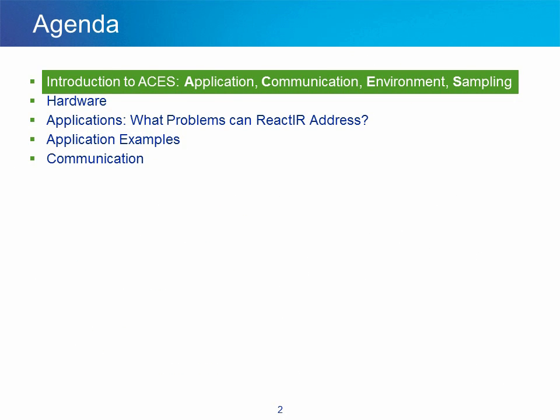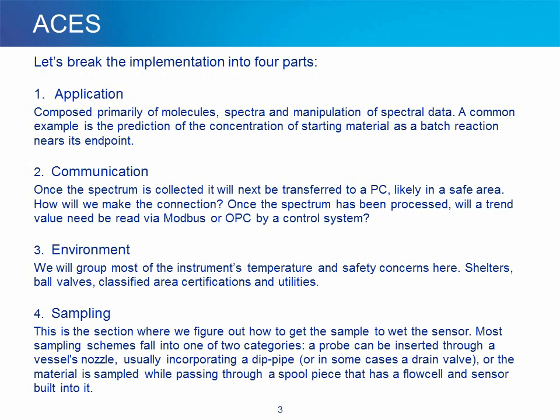Introduction to ACEs. Let's break the implementation into 4 parts. 1. Application. This is the part composed primarily of molecules, spectra, and manipulation of spectral data. A common example is a prediction of the concentration of starting material as a batch reaction nears its endpoint.